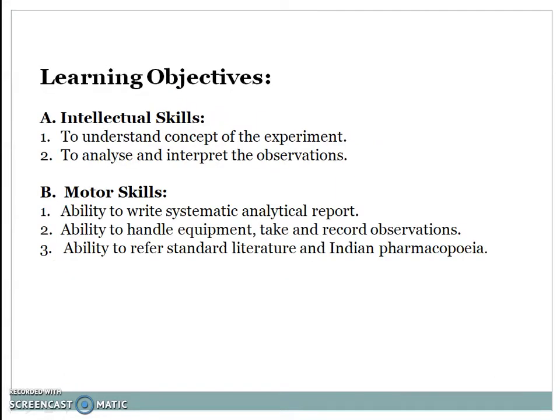Learning outcome for this experiment is to develop intellectual skill, to understand concept of experiment, to analyze and interpret the observation, and second, motor skills, ability to write systemic analytical report, ability to handle equipment, take and record observation, and ability to refer standard literature and Indian Pharmacopoeia.